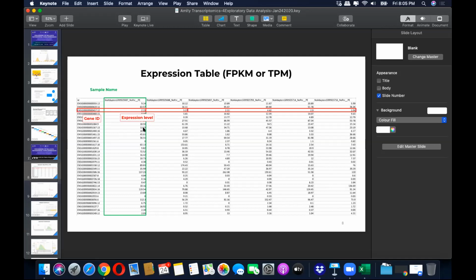It's a read, right? So it is decimal because we are dividing it by something. When we divide, we get a chance of obtaining a decimal point. So that's the simplest explanation of this expression table. I hope it is clear to you now.